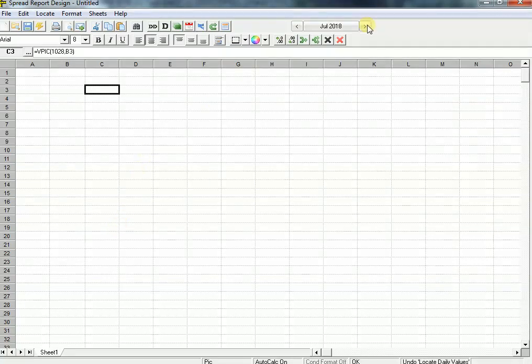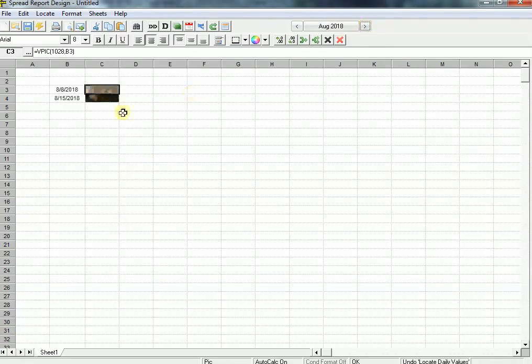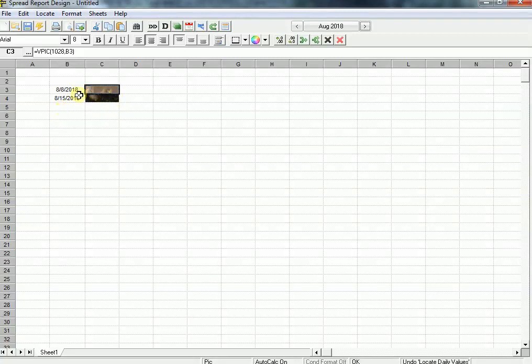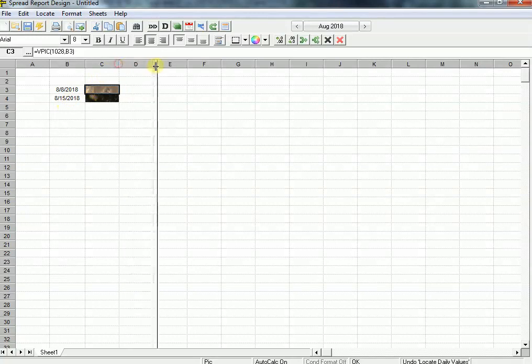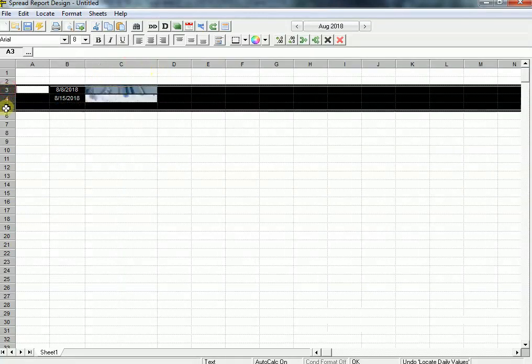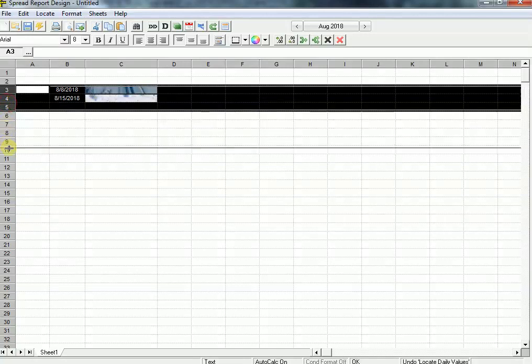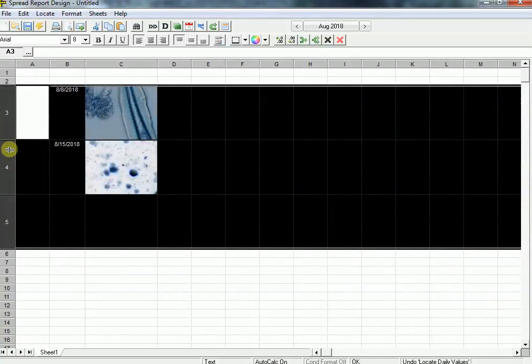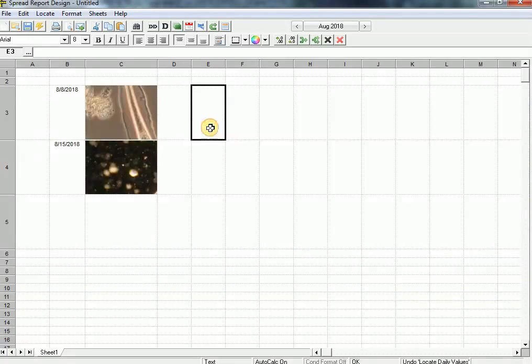And I run the report for August, and I see my two pictures. Now again, given the cell size, this doesn't look very good. So what I would do in this particular case is I would expand these three rows. And I got it.